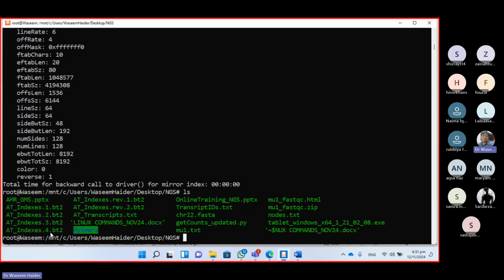If it is hard to understand, just remember this is just a technique used by Bowtie2 to make the search quicker and efficient. Okay. Right, so now you have made those indexes. Next step is you just call the Bowtie2 tool, and that is just for alignment.